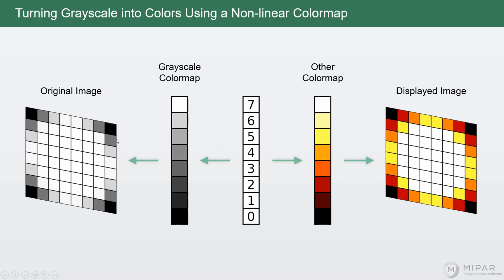So that's fine. But it transforms the data, so this turns now into a 3-channel image of red, green, and blue to add together to form all these different colors. And unless you know the way that this single array of numbers was mapped onto a color image, there's no way to go back.